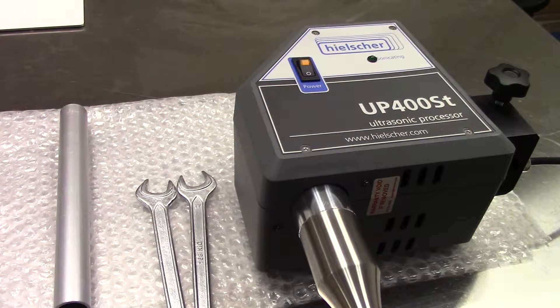Thank you for purchasing the UP400ST ultrasonic processor from Hilscher Ultrasonics. Operation and maintenance instructions can be found on the SD card on the back of your machine. If this is not available, please contact your sales representative.